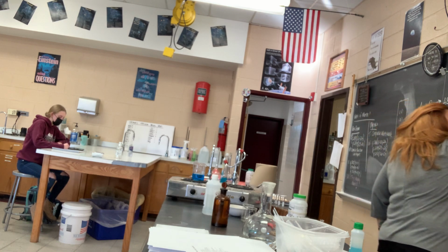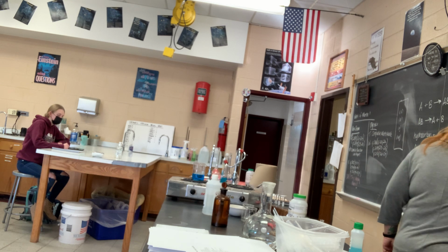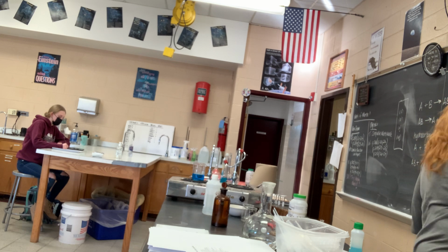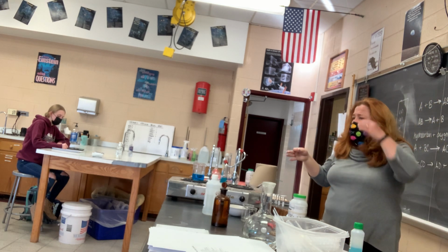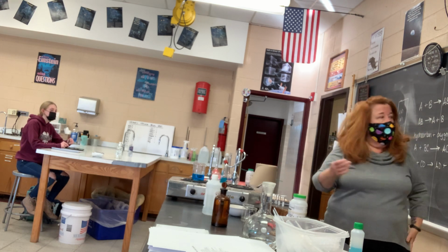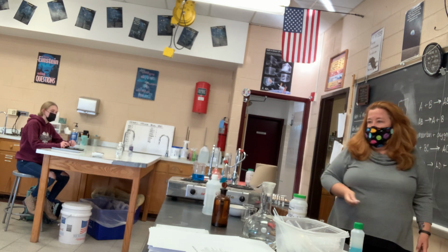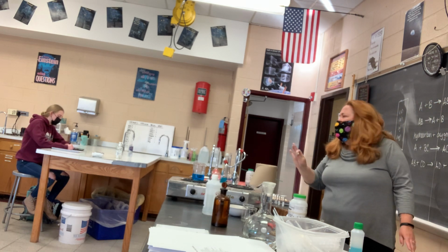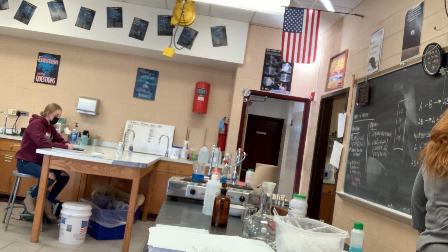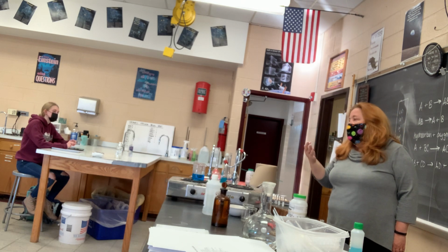So the zinc, I took a piece of zinc and I stuck it in hydrochloric acid. If this were a homework problem, you would look at your activity series and see if it's going to happen, but you know it happened. But you could check the activity series anyway if you wanted to. Zinc was a solid, so if you wanted to get real technical about this and put the actual phases, you could, you don't have to. Hydrochloric acid is actually aqueous. To make hydrochloric acid, they take hydrogen chloride gas and bubble it into water.